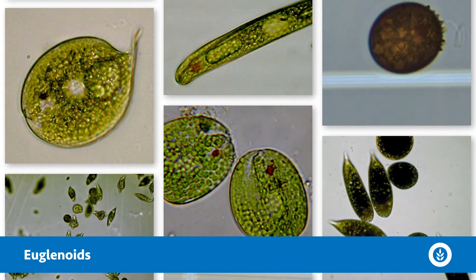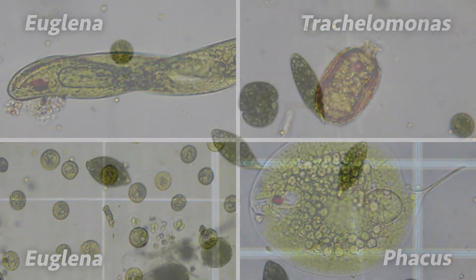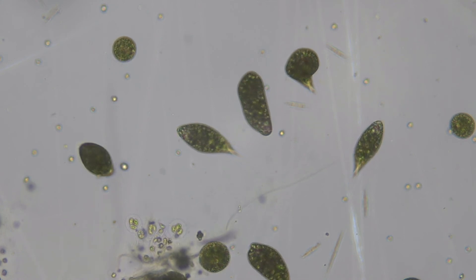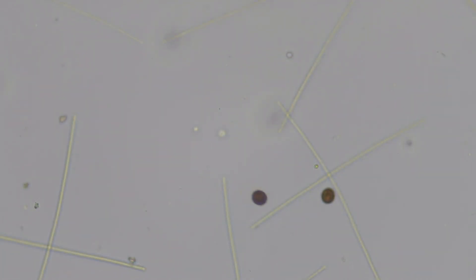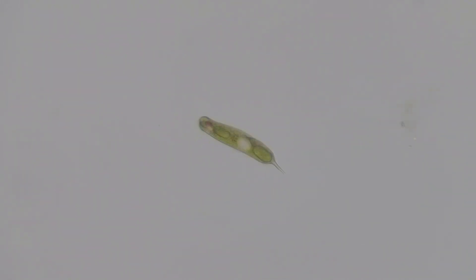Next up is another very cool group — the euglenoids, classified as algae. They include Euglena, Trachelomonas, and Phacus. Most are photosynthetic, harnessing energy from the sun, looking green or darker in color with different pigments. Some euglenoids are mixotrophic or heterotrophic — they can absorb organic compounds, use bacteria, or eat other algae. They're single-celled with a big flagella to help them move around, and they have a neat eyespot that detects different wavelengths of light. A protist classified in the big group of algae.